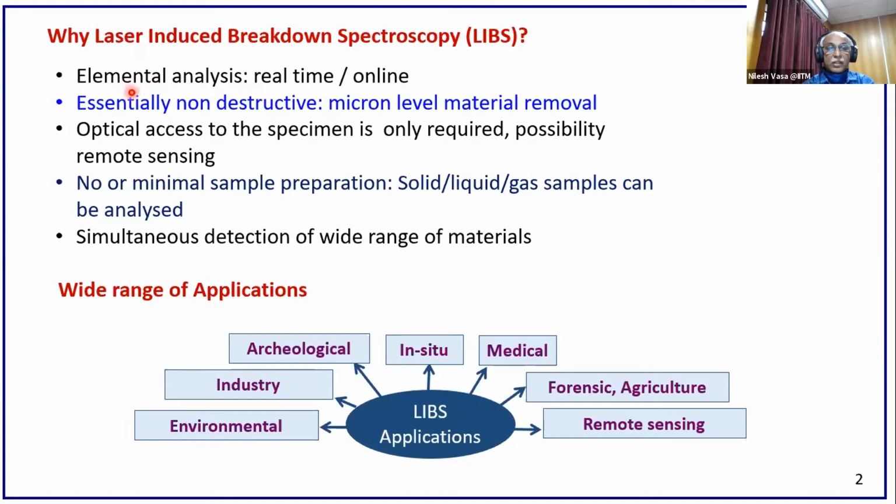Basically, laser-induced breakdown spectroscopy, LIBS, is a very useful elemental analysis tool because it offers real-time or online analysis of elements. Essentially, any material can be ablated and we will be able to analyze it.